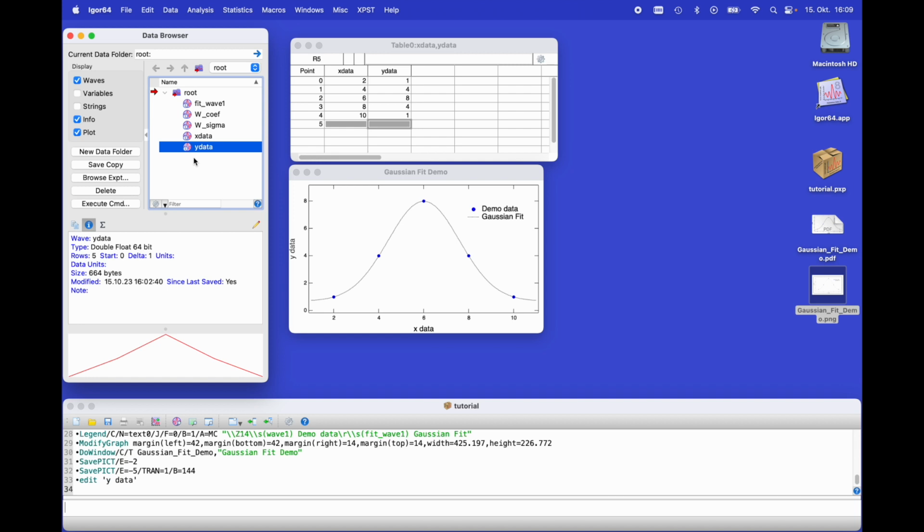So if I now want to create 2 more waves with X and Y data to show you some of the extra features which waves have, I would have to use different names because names have to be unique, for example, by adding a number. But there was another option, namely that Igor supports to have data folders in one experiment. So now here we see the option new data folder.